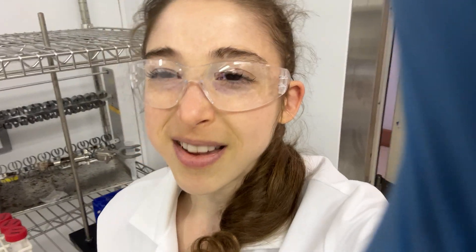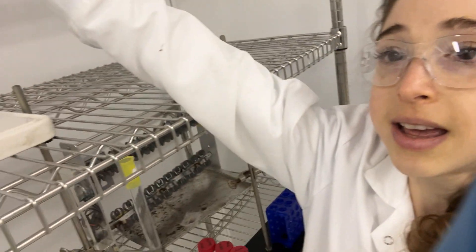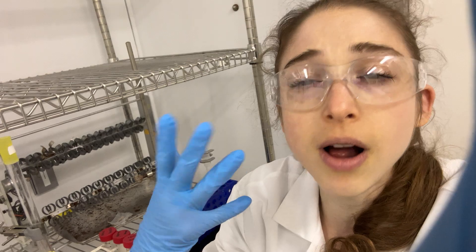Resin is just a word for little beads. Basically we have this column filled with nickel-coated resin. Our protein has that histidine tag that's going to bind to that resin. So we flow the protein through, the protein sticks, other stuff flows off, we wash things off, and we get our pure protein. Voila!